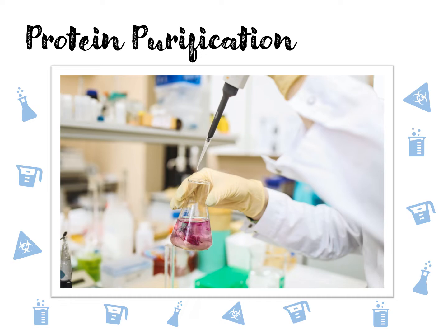Now when lysing the cell, it is crucial to keep certain points in mind. If I briefly recapitulate, the primary point of concern is to ensure that A, your protein is indeed released from the intracellular compartment where it is stored post synthesis by the cell, and B, during the lysis process, your protein does not undergo denaturation or is not damaged in any way. You also have to keep in mind that your protein's subsequent purification steps should not be affected by the choice of lysis method.